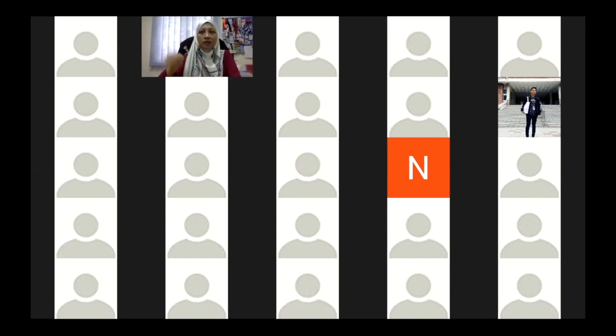The column shown in the video is the capillary column. You can see it looks like a circle, in different sizes. Some are very long, like 10 meters long, that's why it is in spiral form. It's very small and very fragile, so you cannot drop it.